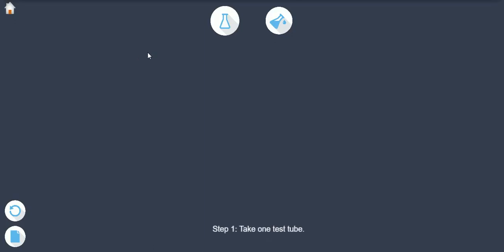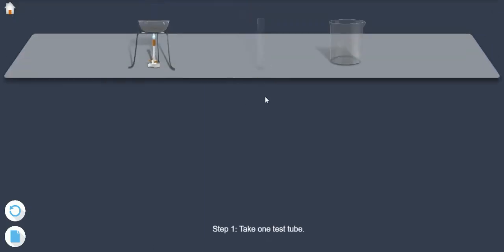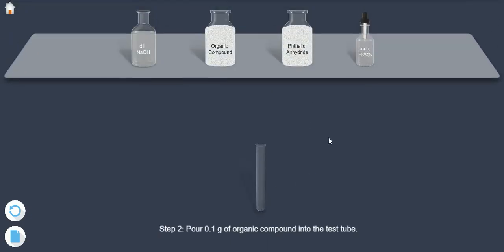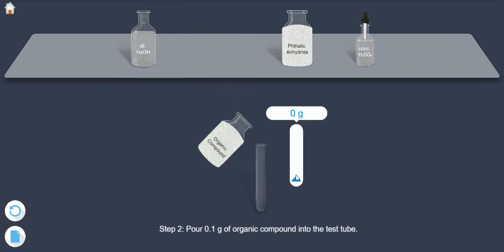Step 1: Take one test tube. Step 2: Pour 0.1 gram of organic compound into the test tube.